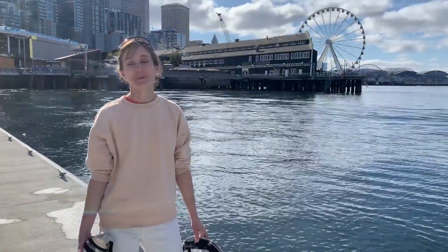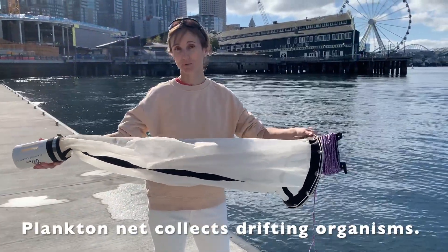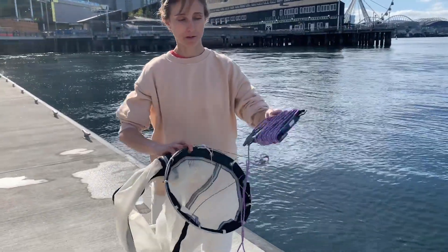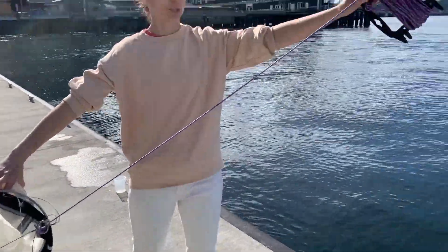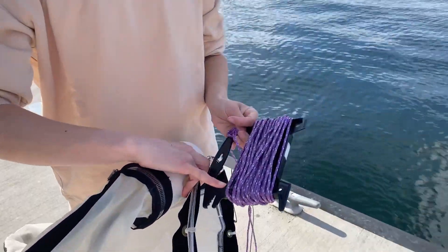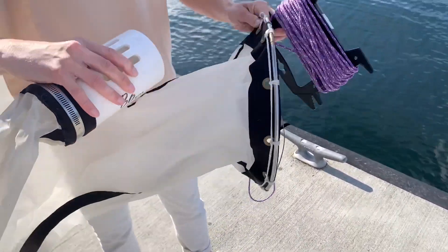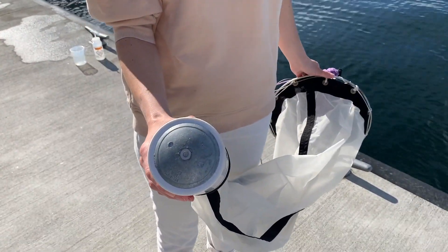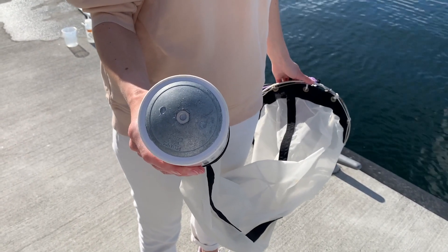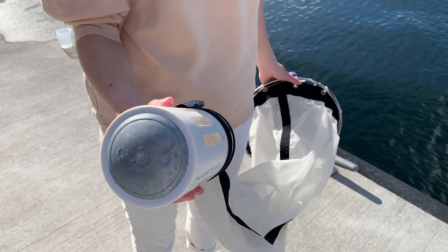The next piece of equipment is the plankton net, and the purpose of this net is to catch drifting organisms, which we call plankton. The plankton net has a couple things in common with the Niskin bottle. At one end the net is attached to a line, although this line we only have marked at one location — this is the 10 meter mark. At the opposite end there is also a weight attached to this instrument, and the purpose is the same: to make sure that the net sinks straight down vertically into the water rather than drifting off to the side or not sinking at all.